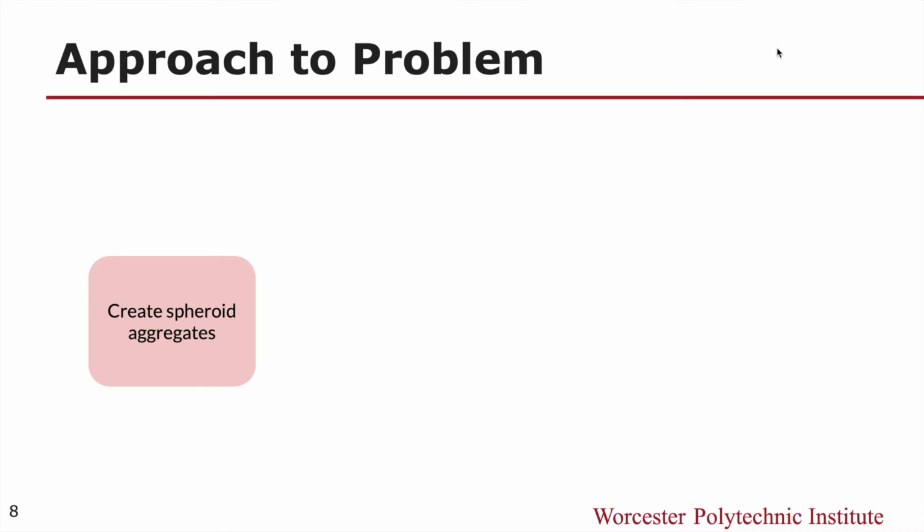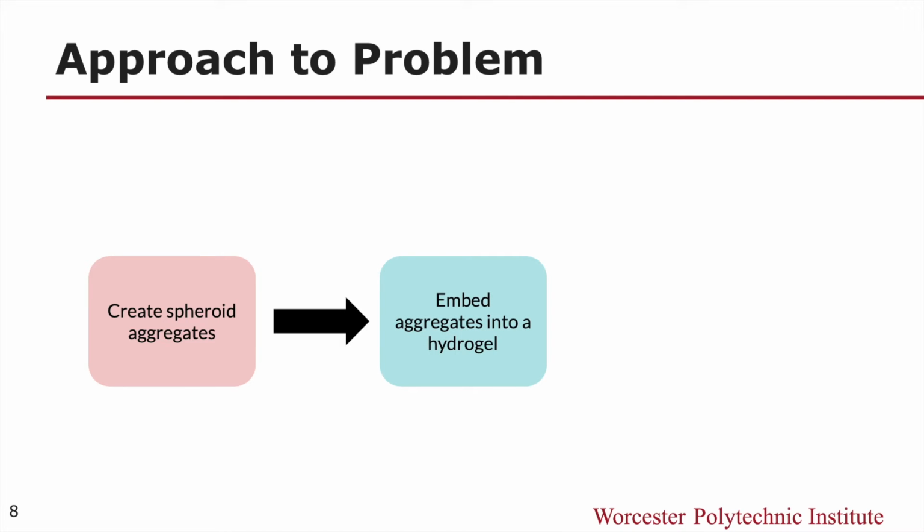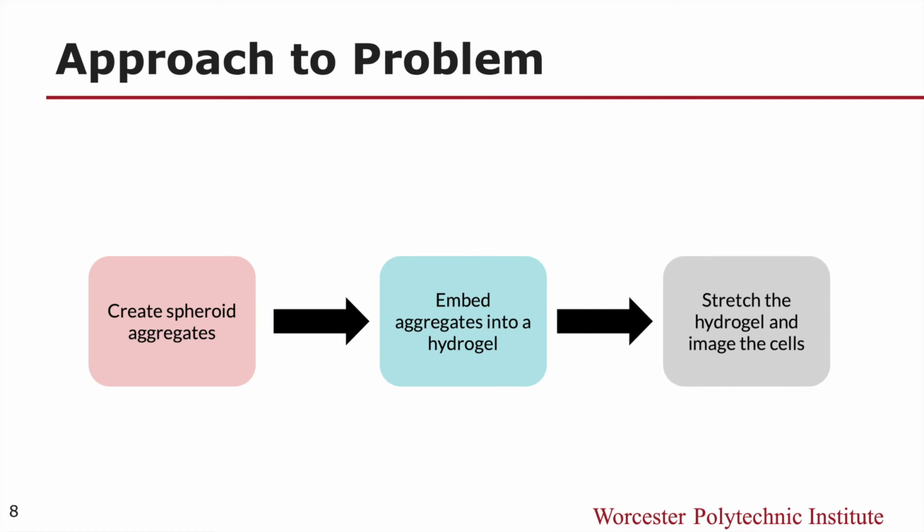To meet our goal, we will approach the problem by creating spheroid aggregates, embedding these aggregates into a hydrogel, and then applying a tensile stress to the hydrogel with the aggregates inside of them.